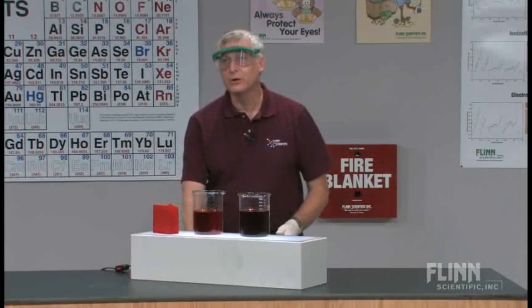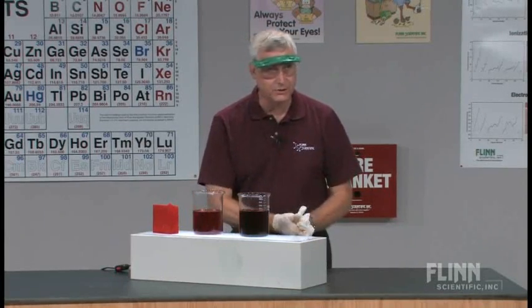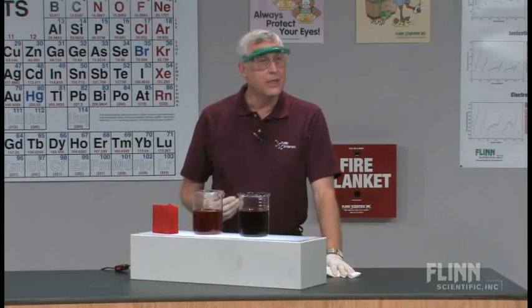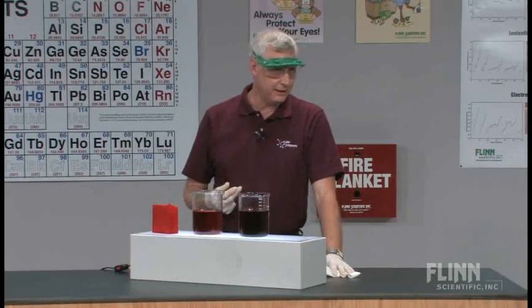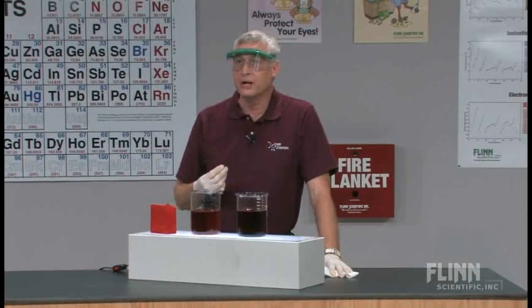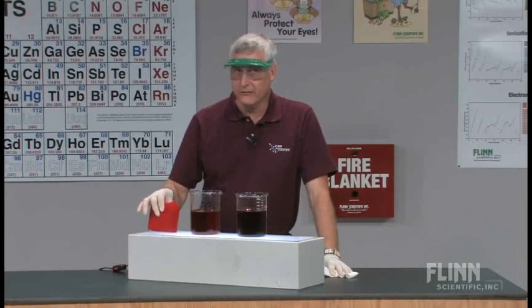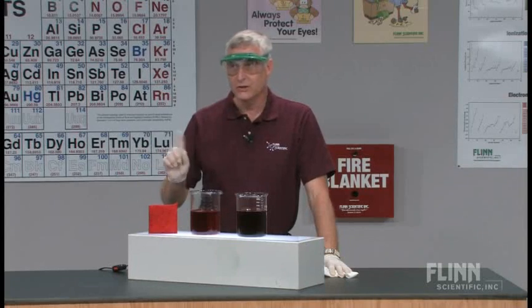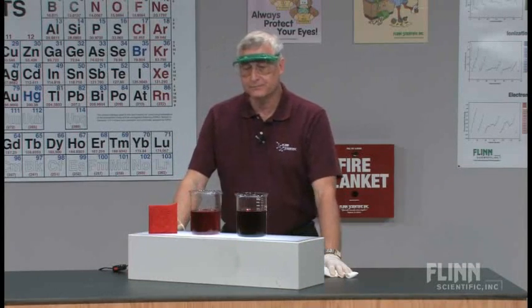Obviously, it works for when you're dealing with acids and bases and indicators. And they're familiar with universal indicator. We will have used that a number of times. They will be familiar perhaps with phenolphthalein. They will perhaps also be familiar with litmus. They've probably never seen Congo red and seen the color change that takes place with that. So that catches them a little bit by surprise.